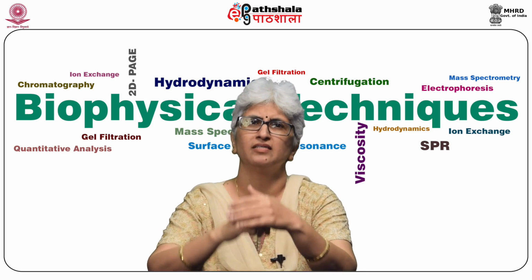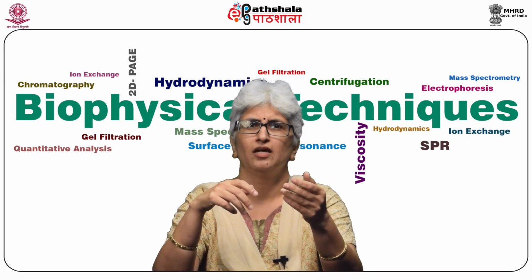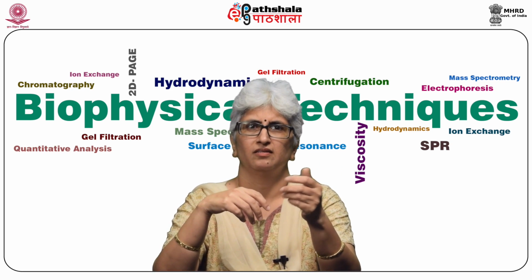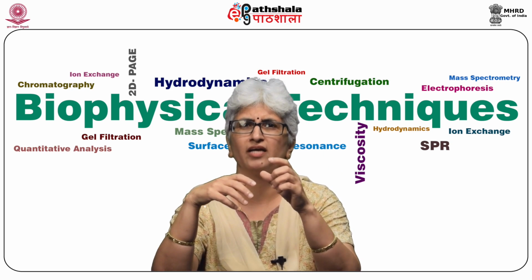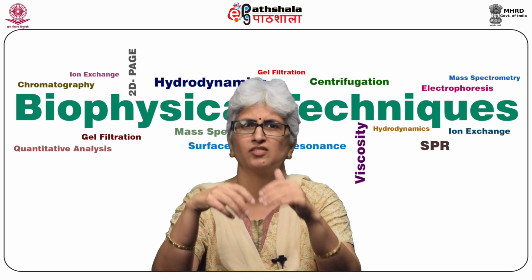Another method is affinity purification with immobilized antigens. To purify a specific antibody from a crude sample, this strategy is applied. Antibody-specific antigen is first covalently immobilized on a solid support matrix, and then crude sample is passed through it.